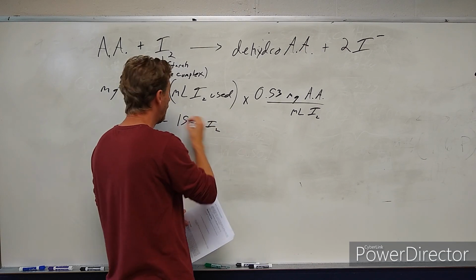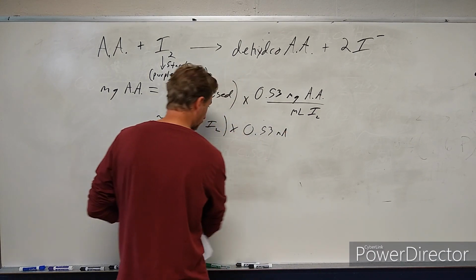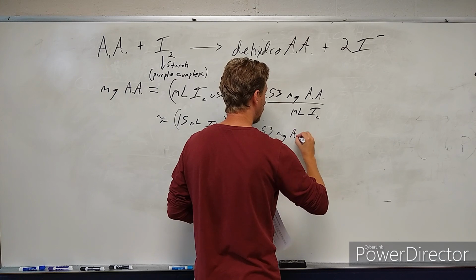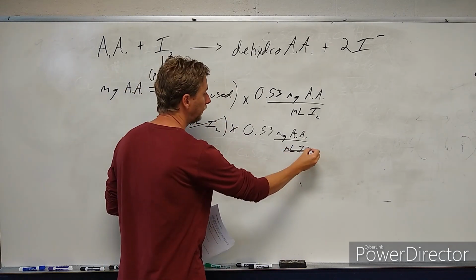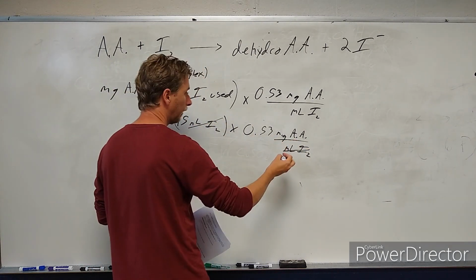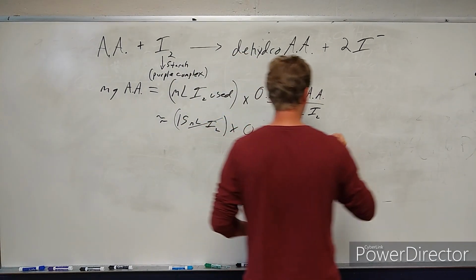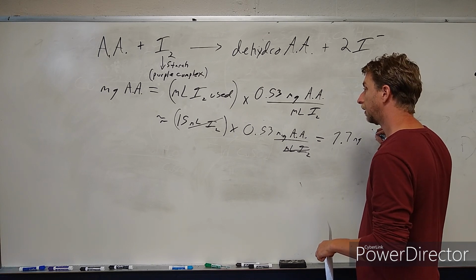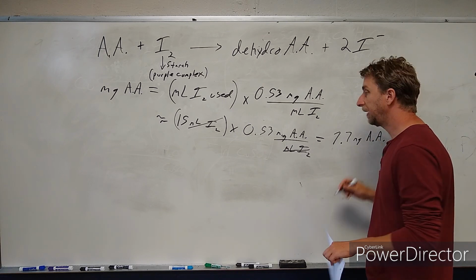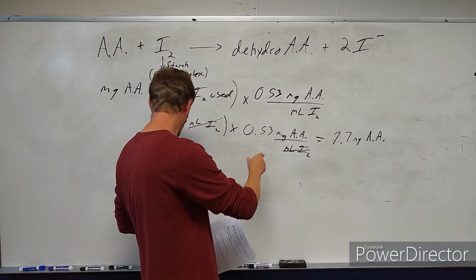Well, all we need to do is take that and multiply it times 0.53 milligrams of ascorbic acid per milliliter of iodine. And you see that the milliliters of iodine cancel, and that leaves you with just your answer, milligrams of ascorbic acid, which, if you can see, 0.53 is about half, so it's going to be a little over 7.5. Let's say 7.7 milligrams of ascorbic acid. And you say, well, that was in the juice sample. And I need to get a calculator to double check that. I'll go grab one in a second. But anyway.